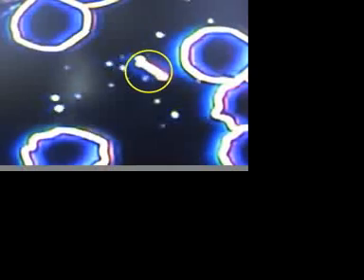This is an Organism X or what I may want to call an Organism Y in that it appears to be too thick for an Organism X. But again, it does have the two heads on it. It's even thicker than a blood cell wall. And this is just something we have to look at.